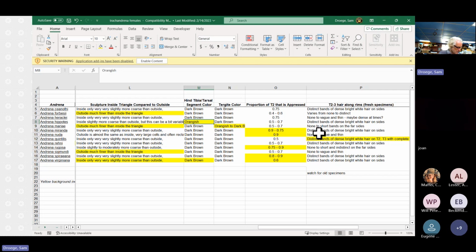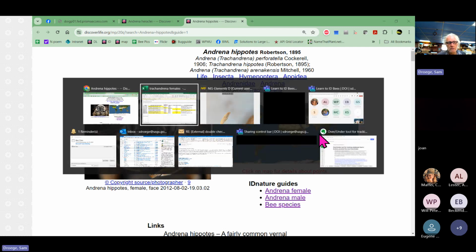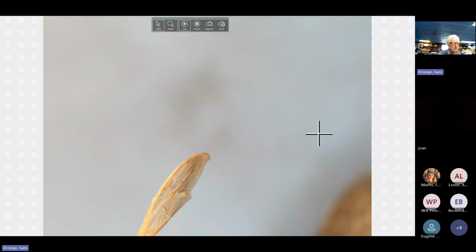Okay, so let's see if we can find this one. Looks good. So yeah, these are sometimes a very dominant member of the area. I think we'll start with the face because we've been looking at some facial features, and this has a pretty generic look for the group, and we can look at some of the features that might be a little bit tricky on the specimen. We can look at some of the features that contrast with the last two.